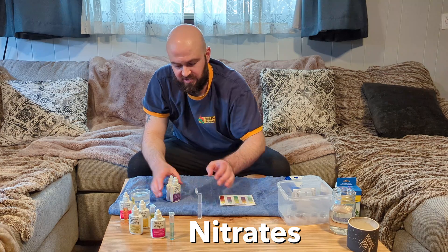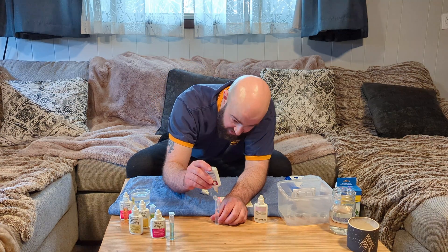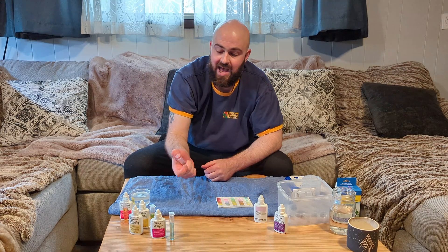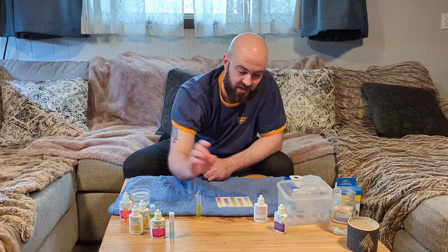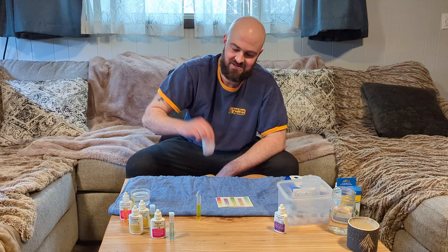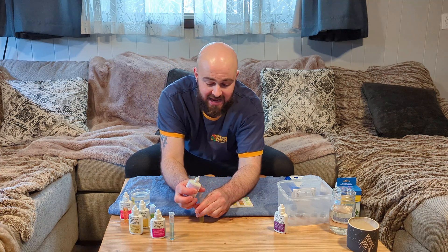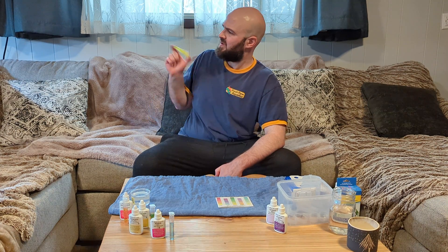Now for the nitrate test kit — this one's a little more complicated than the others, but still pretty simple. Start by adding 10 drops of solution number one, cap it, and give it a little inversion. Then vigorously shake bottle two for 30 seconds. The vigorous component is very important — if you just casually shake it, it will not give you the same result. After shaking for 30 seconds, add 10 drops to the test tube, cap it, and vigorously shake for one minute. Then let that sit for five minutes, just like all the other ones.